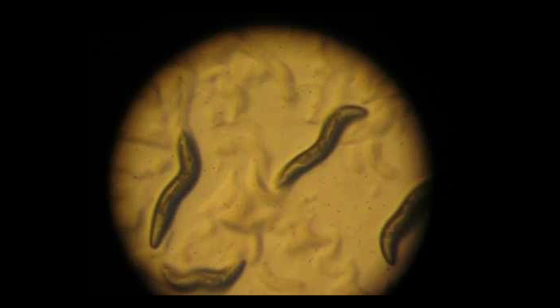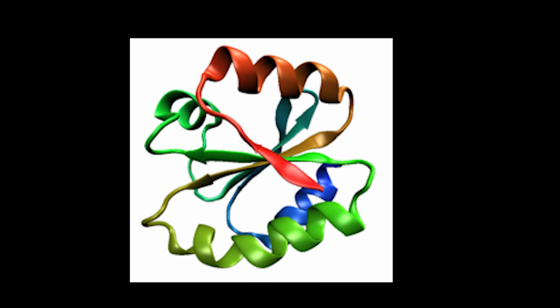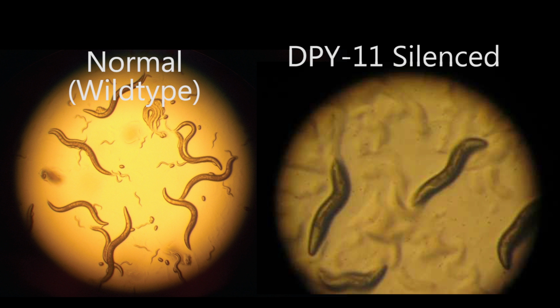We were assigned to silence the DPY11 gene. Its function was to create thioredoxin-like proteins. These proteins serve for morphological maturing as well as body and sensory organs. The results we observed, that being small, dwarfed, and sluggish C. elegans, is fully supported by the silencing of this protein creation.